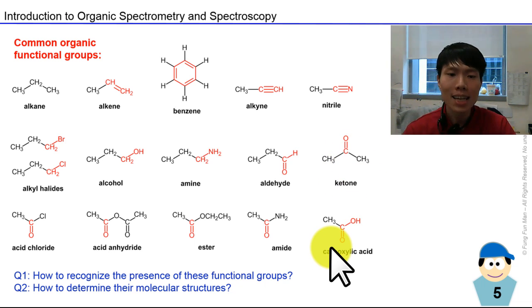So how can we detect the presence of this functional group in a molecule that's unknown to us? Let's say you want to synthesize a drug. By mechanism, by theory, we know that it should be that product, but you need to confirm that that's the right thing. So we have to conduct analytical techniques to analyze this sample. One of the methods is mass spectrometry. We think about this as my pure product, we fragment it and see, could there be a possibility of having this fragment from the theoretical product? And how could we determine these structures, right?